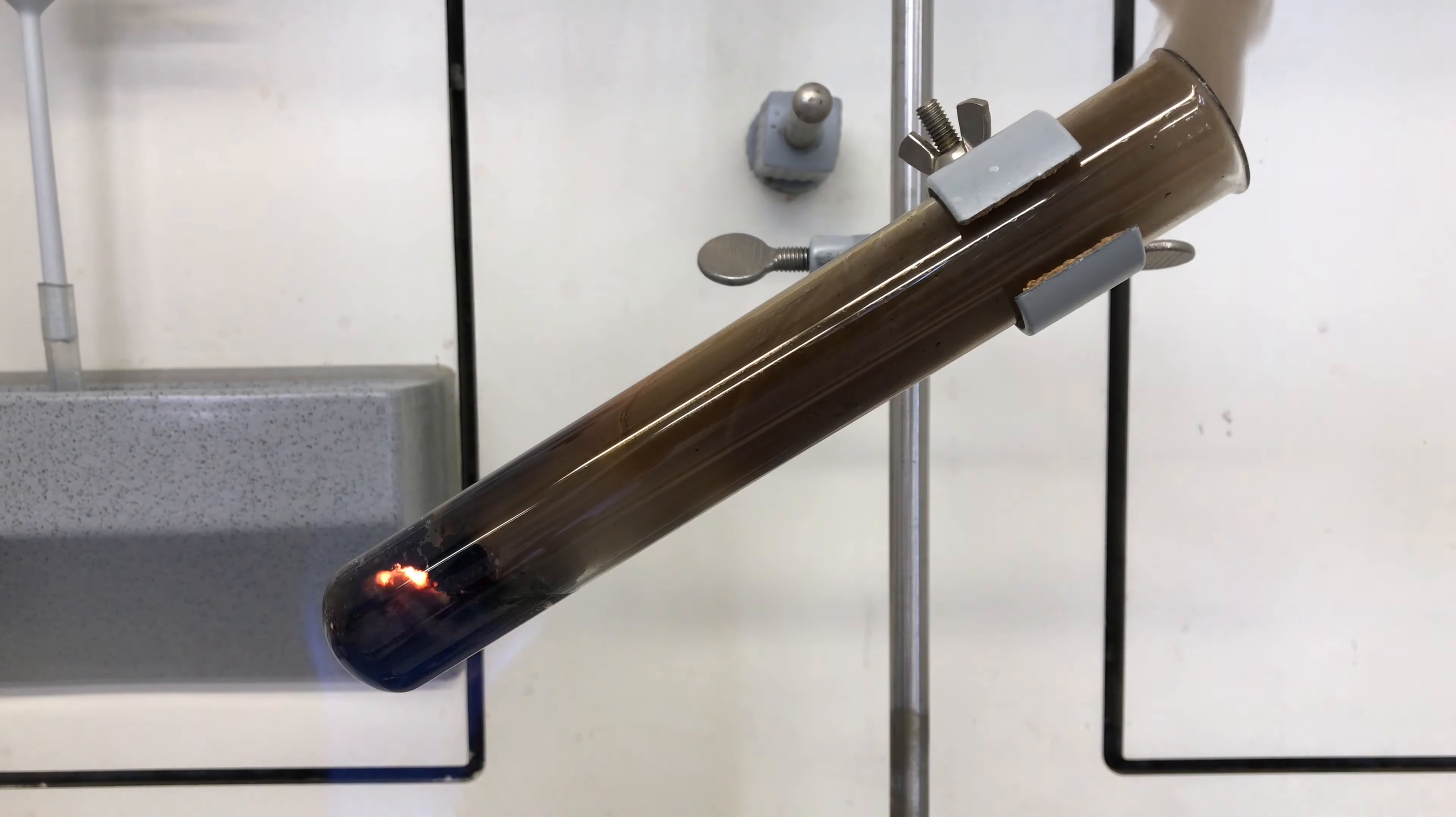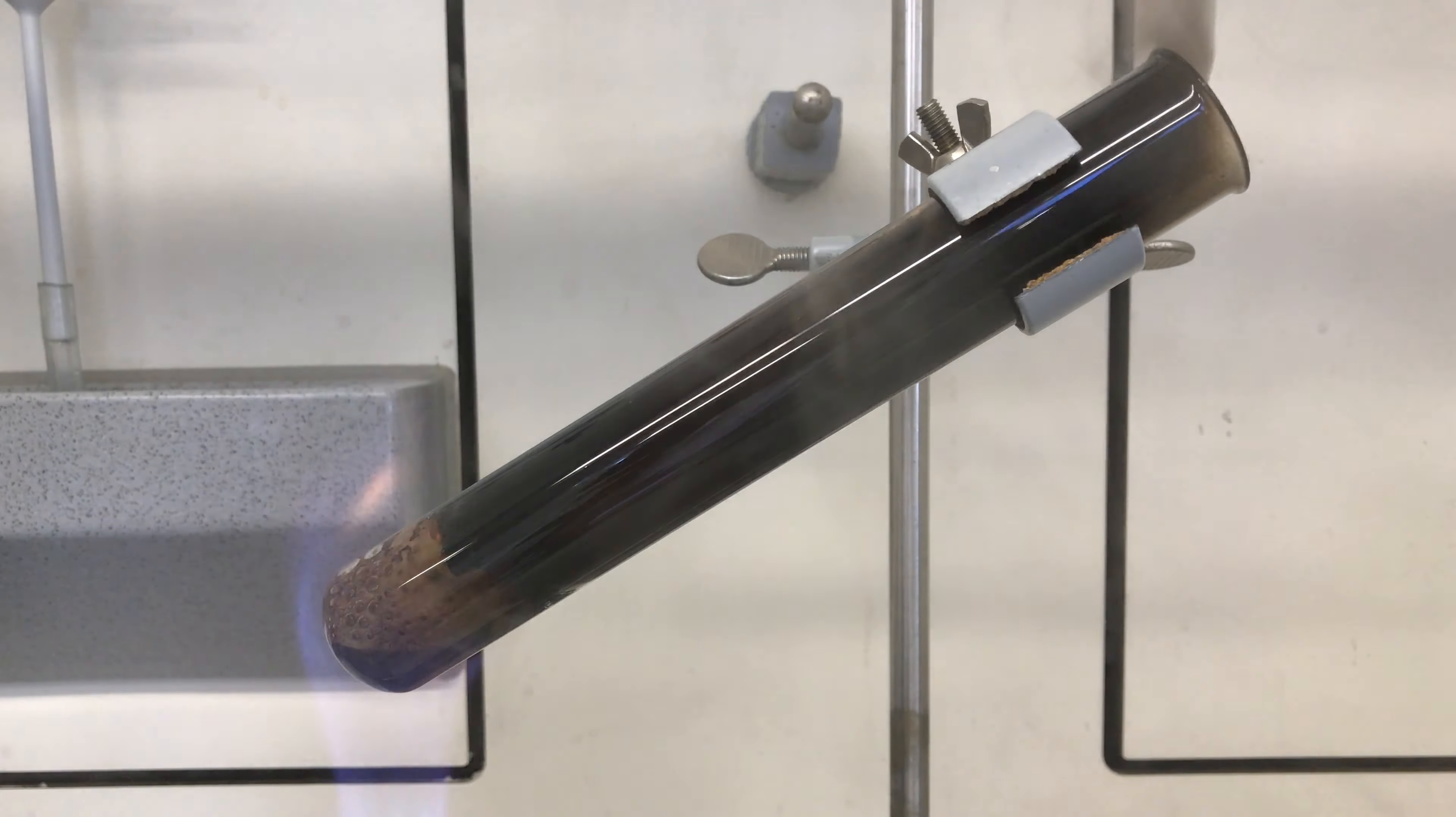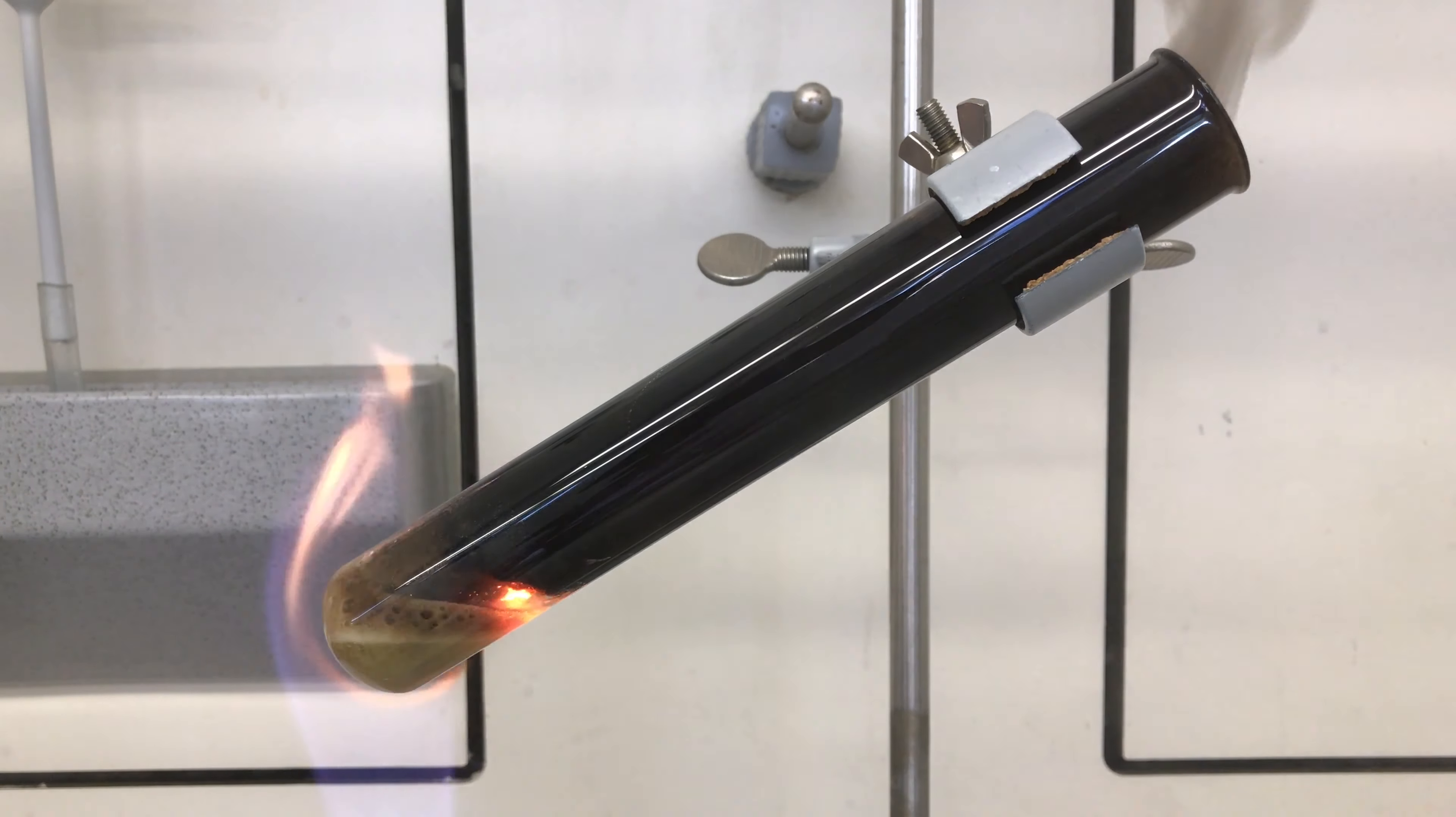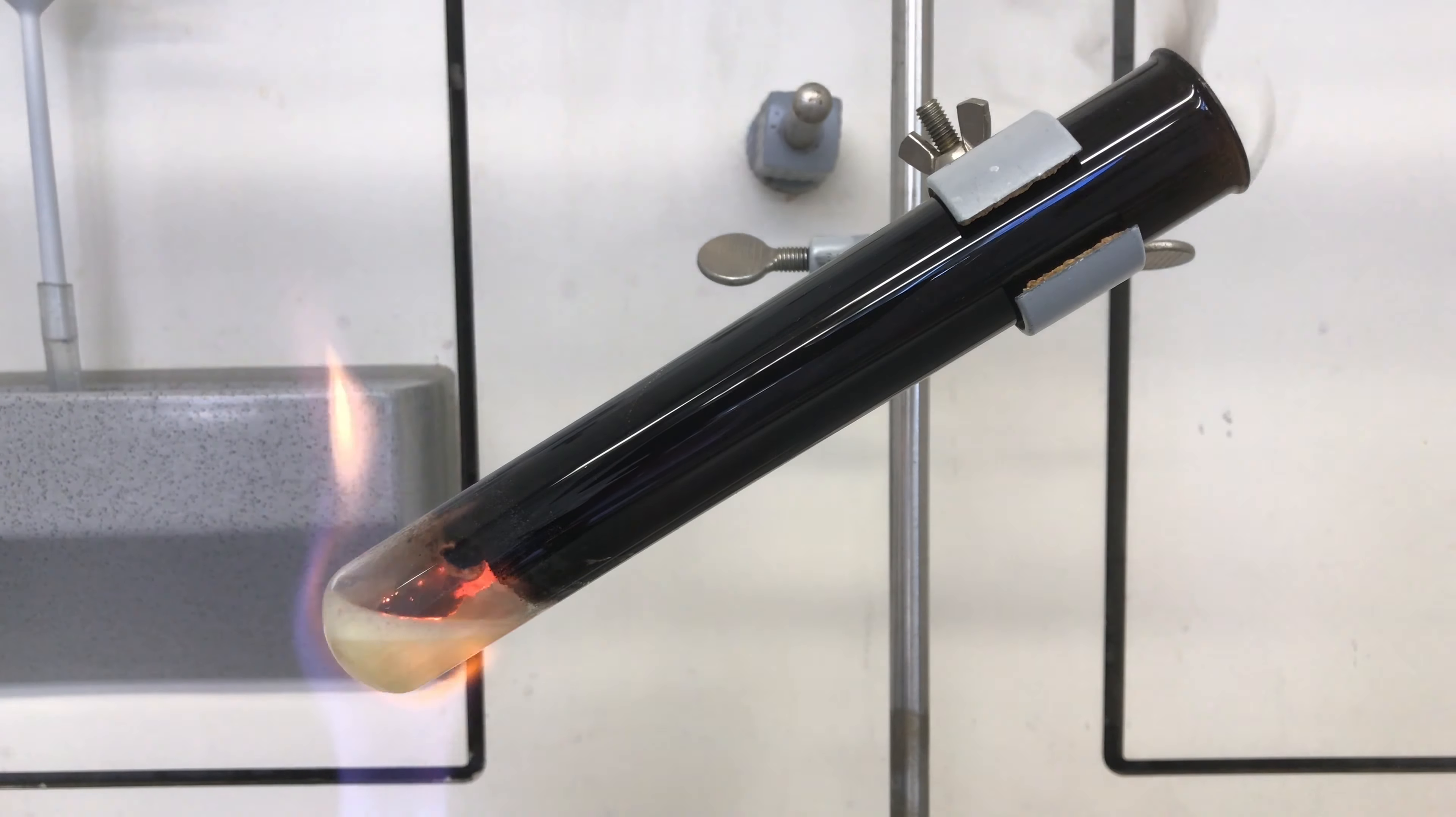It took a long time but after heating it up it finally started to burn in the test tube. As it got hotter you can see that the carbon in the molten potassium nitrate was quickly oxidized and it turned clear.